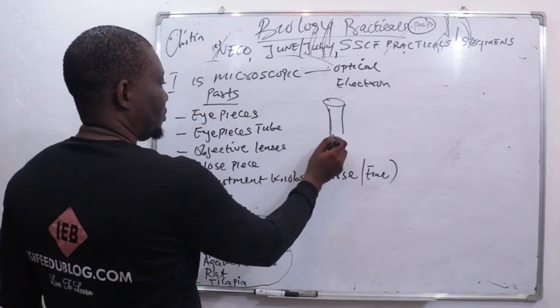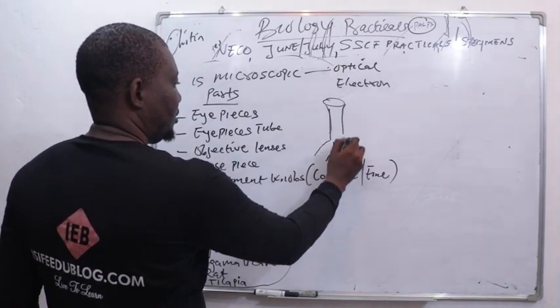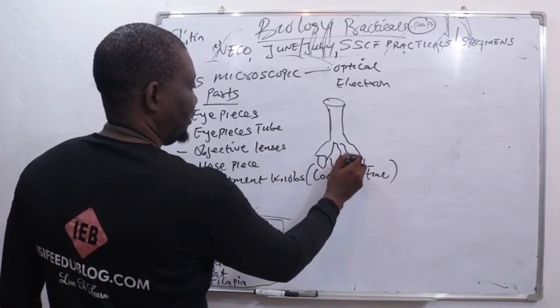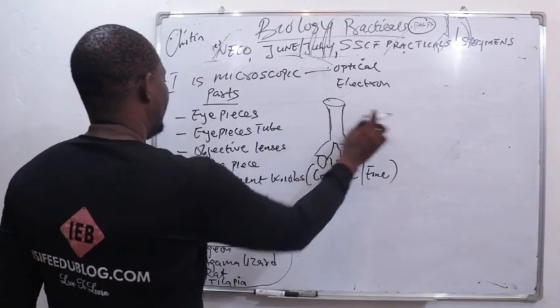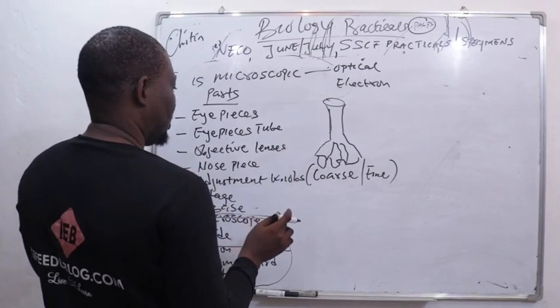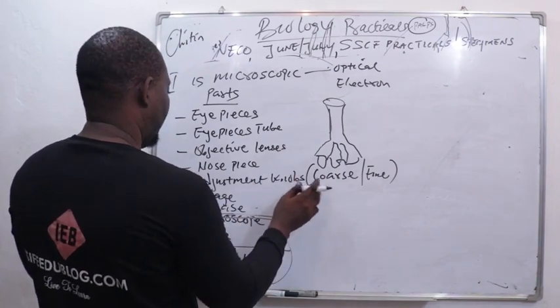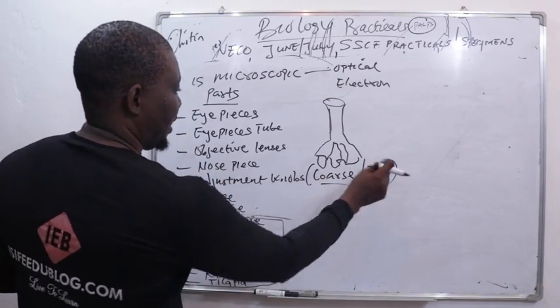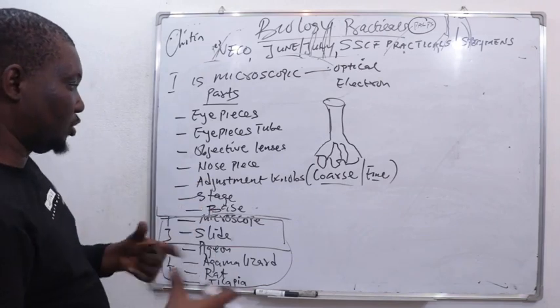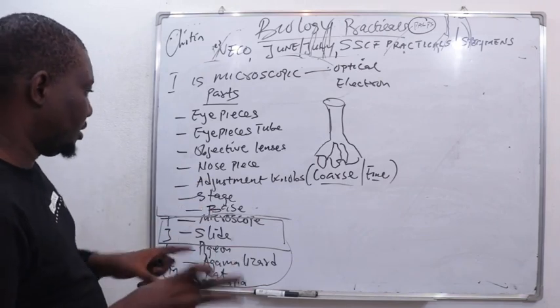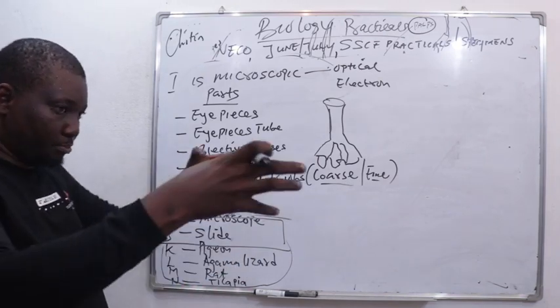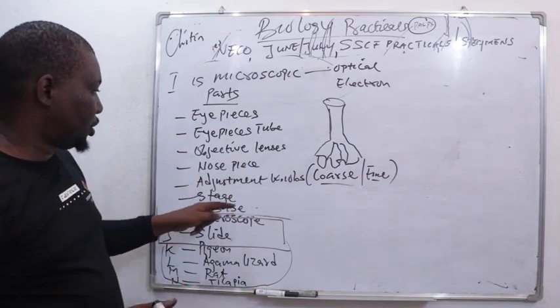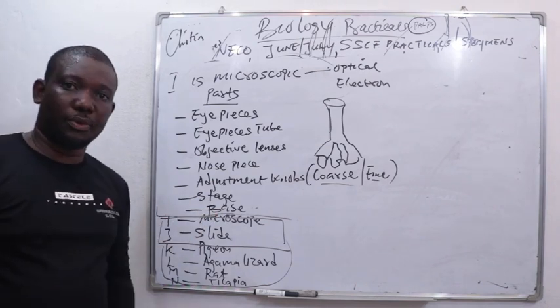Then you have some objective lenses here of different magnification. This is the tube. Then the nose piece and the adjustment knob. There are two: fine and coarse adjustment, to make adjustment of the specimen when you are bringing it close to magnify. Then the stage and then the base for standing.